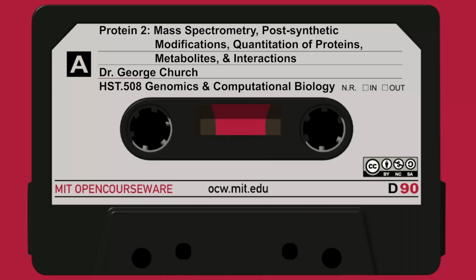But basically, your reverse phase liquid chromatography is going directly into this vacuum here, generating a little spray at 4,000 volts, and then these molecular ions will go through the vacuum through a series of magnetic octapoles until it hits an ion trap, which helps you determine the M over Z, and finally a detector. You can see there's a variety of different pressures in here, sort of increasing pressure from the point where you have the aqueous solvent going in all the way to the detector, which is the highest vacuum at around 10 to the minus fifth torr.